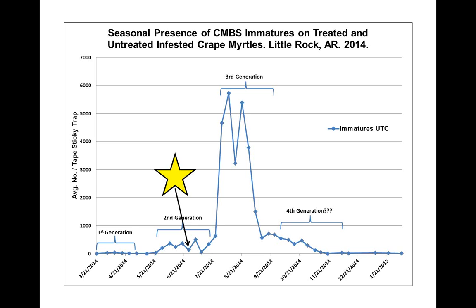In fact, instead of using standard blue line paper, you could make a paper with a grid on it, and use graphing paper. Yeah, that might help, especially for the highest counts. And then you could really randomly select the squares and count them. But I think for lower numbers, you just go ahead and count everything. It didn't take me that long to count. I had maybe a couple hundred crawlers on my sample from this week. It didn't take that long to do it. But if it was 5,000, that would have taken a long time.